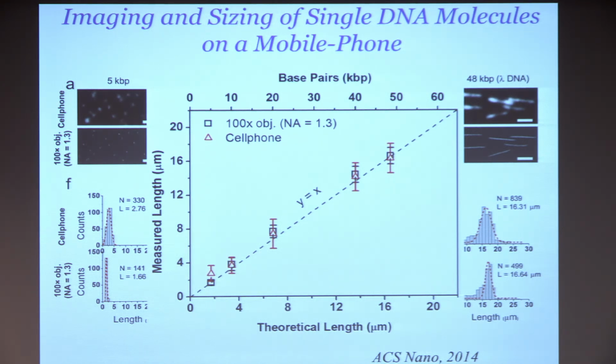In this regard, you can also use this kind of an analysis for looking at copy number variations. One thing that we're pushing this for is understanding drug resistance in malaria and TB by looking at the count of certain genes within the backbone of the DNA. Now you can start to do some of these genetic experiments using a microscopy tool that can see and size different genes specifically through labeling.